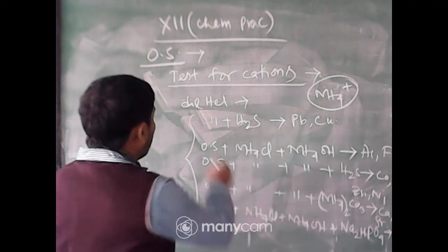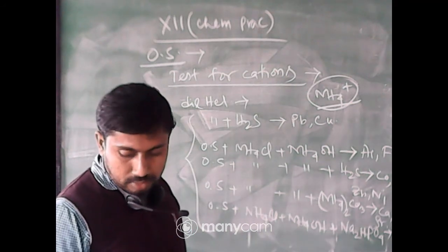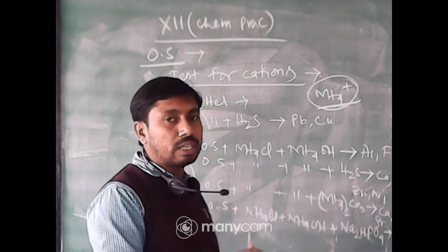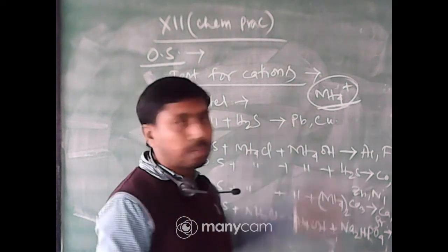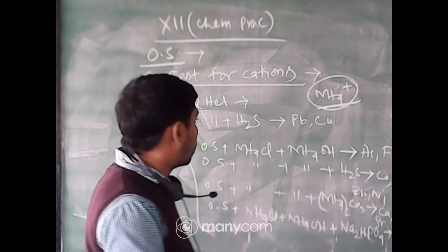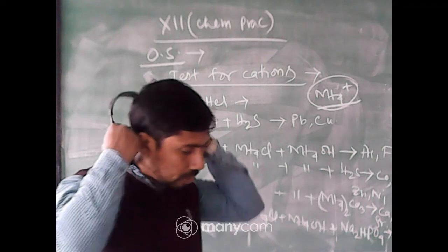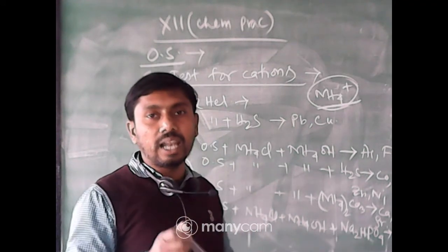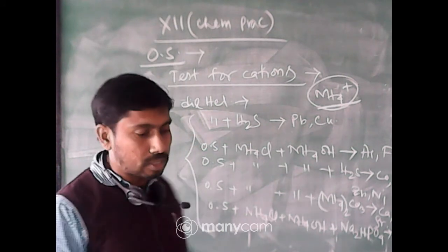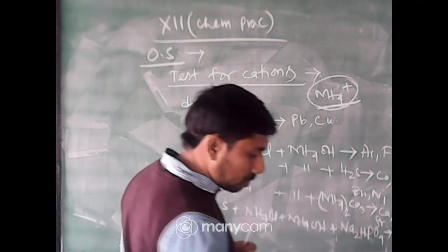Okay. So, as I know that the sample taken here is ammonium, I am doing the ammonium test first. You will also do the test for ammonium first, because if it is present, then you can confirm it before going to the group separation. Okay. So, the test for ammonium. Now, you can just see the color change, but you do not take the smell of the sample. So, only the color changing experiments will be seen here. Okay. So, just see the experiment.